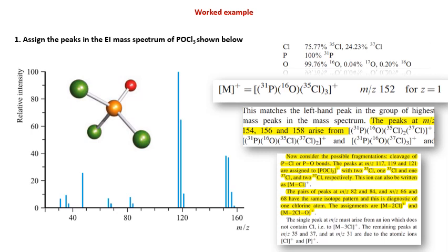You can name this kind of peak as M minus Cl plus. The M is for the molecular ion peak, and minus Cl means one of the chlorines is clipped. So this is the designation for how to write this kind of fragment peak.